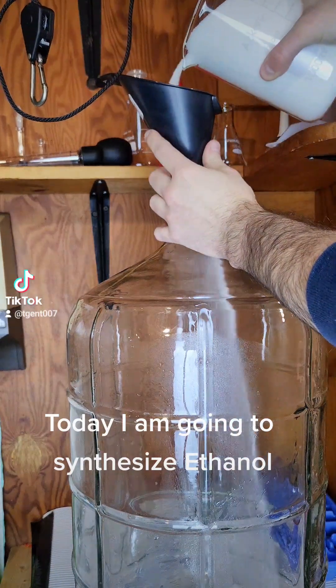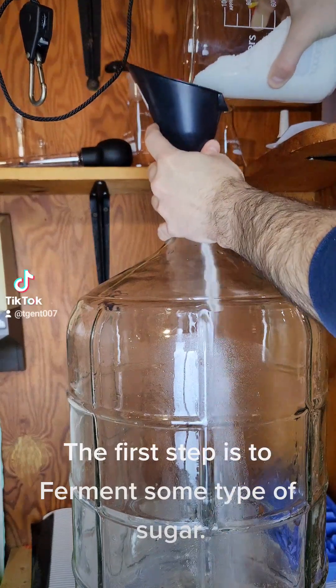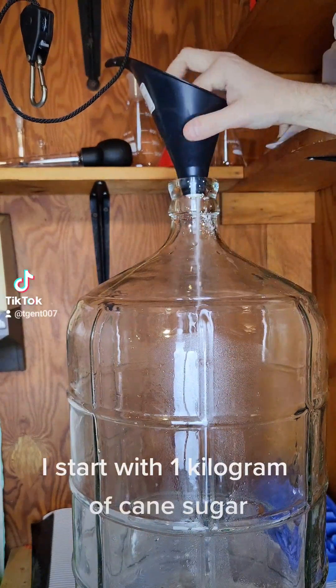Today I am going to synthesize ethanol. The first step is to ferment some type of sugar. I start with 1 kg of cane sugar.